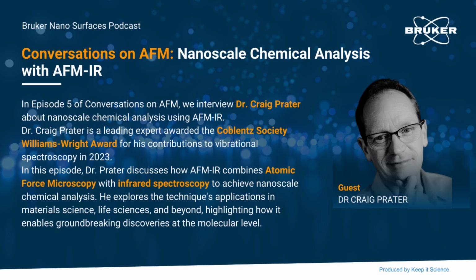It's really interesting to hear where it all started. So you kind of spoke initially about the Fourier transform infrared spectroscopy, or FTIR, and then you also spoke about the synchrotron, which is amazing.